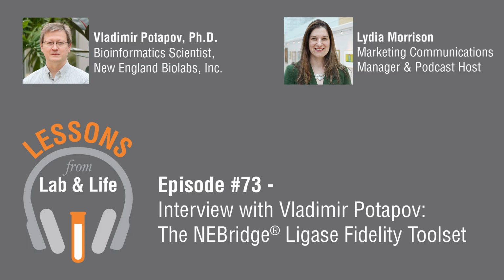There's an interesting story behind the ligase fidelity tools. It goes back to what I said at the beginning, that at NEB we have a large research department, and we conduct a lot of basic research and applied research. As part of that research, we are trying to understand properties of different enzymes, for example, T4 DNA ligase. As part of that particular project, we are trying to understand mismatch ligations of overhangs that can be carried out by T4 DNA ligase. A large experimental study was designed, and from it we got a lot of data on biases and preferences of T4 DNA ligase in ligating those overhangs.